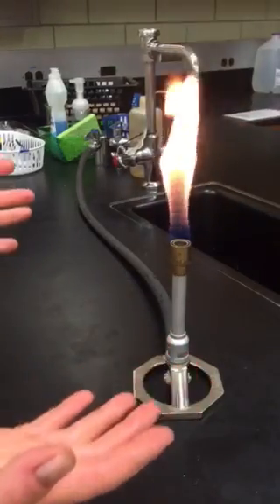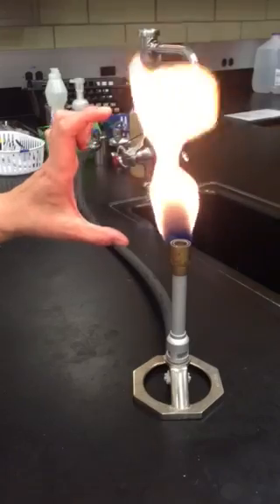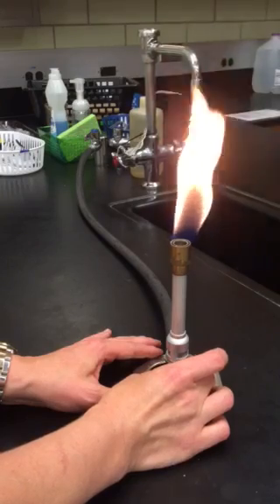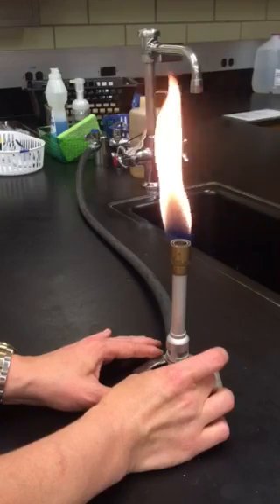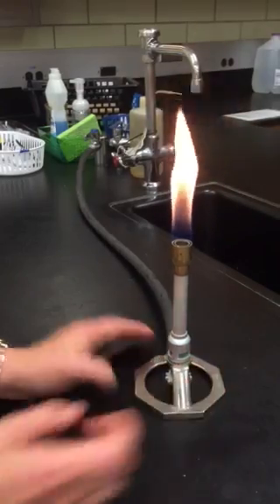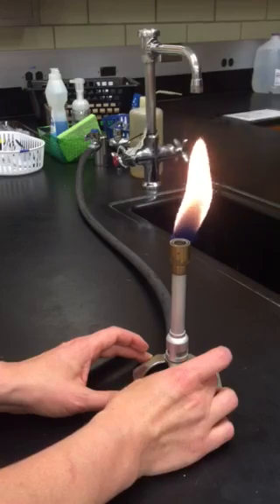Right now the flame is a little too big. We would like the flame to be about eight centimeters tall. So I'm going to go ahead and reduce the amount of gas to get the flame to the height that I would like. And that looks to be about the right height for lab work.